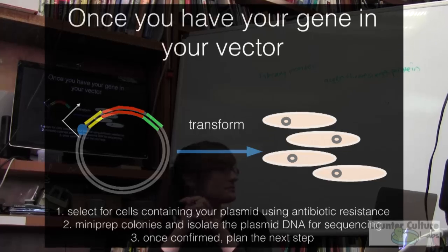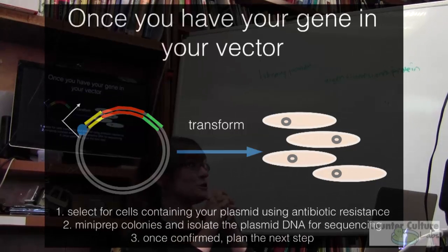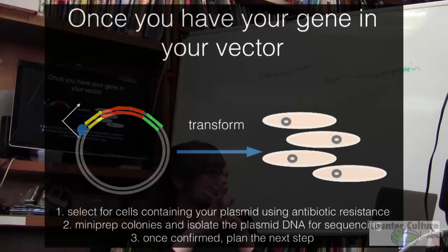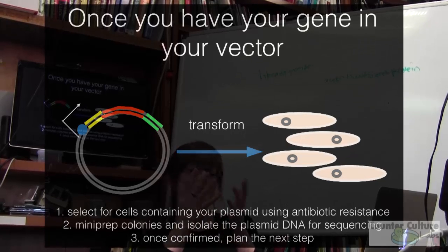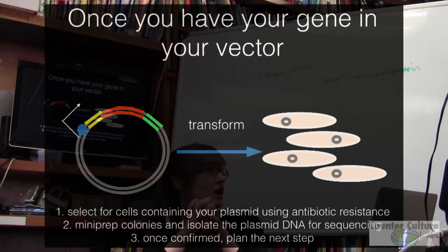Could do a gel? You could do a gel, okay. So at what point would you do the gel? What do you think you need to do? Right after cloning and ligating, is that going to be enough DNA to see on a gel, do you think? Probably not. It depends how big your reaction is, but probably not. So what would be the best thing to do, you think? PCR. Okay.